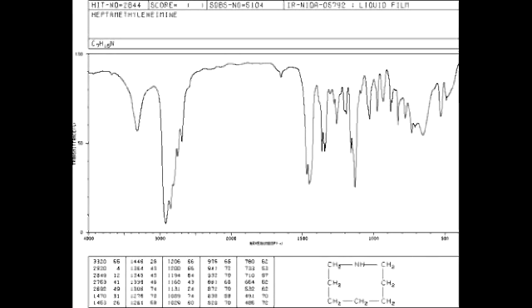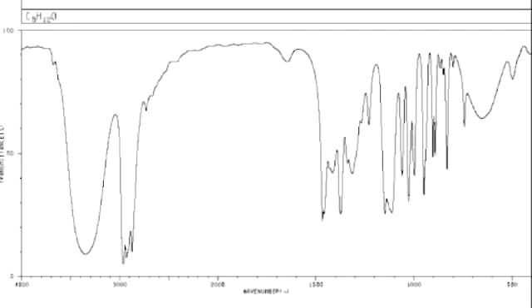We know that from the molecular formula and the double bond equivalencies, but even if the formula weren't given, we'd still know, because if you look at 3000, those big jaggedy peaks are all to the right of 3000 and none are to the left. Therefore there are no unsaturated C double bond CH structures in this molecule.